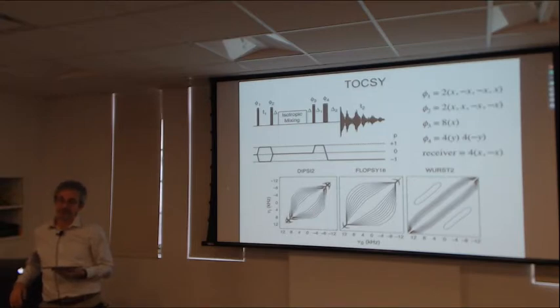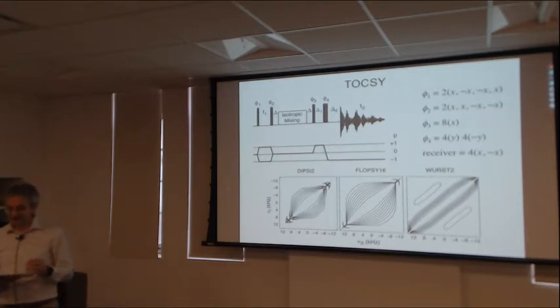Right, so the question really comes down to what's the size of the J coupling compared to the size of R2, because during this block there's going to be relaxation losses. One can try to arrange this so that you end up averaging T1 and R1 and R2. So the situation is a little better than you might think, but still, the relaxation losses become limiting.